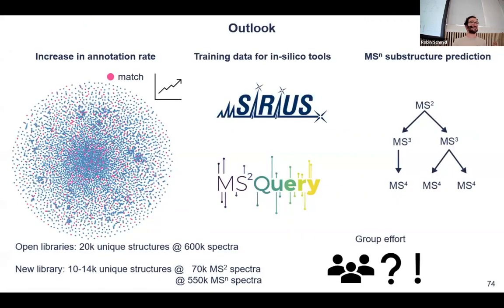So that's at least for the reference data generation. It's very interesting. Thank you. I have a question, because when you generate this, the spectra are a summary of different energies, like consensus spectra or something. Consensus spectra, yeah. Did you ever test what kind of score it gives you at the end?